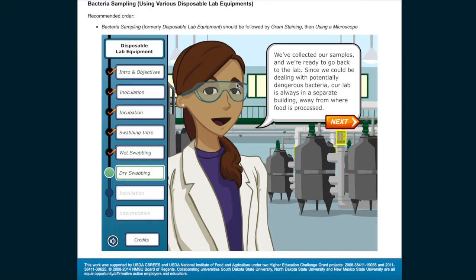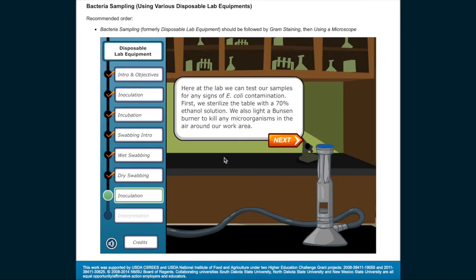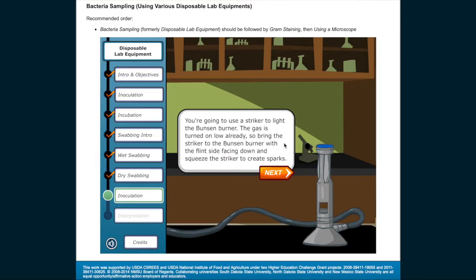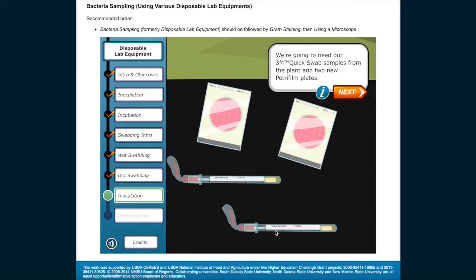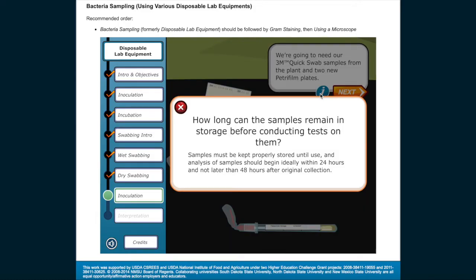Since we could be dealing with potentially dangerous bacteria, our lab is always in a separate building away from where food is processed. Here at the lab, we can test our samples for any signs of E. coli contamination. First, we sterilize the table with a 70% ethanol solution and light a Bunsen burner to kill any microorganisms in the air around our work area. Use a striker with the flint side facing down and squeeze to create sparks to light the burner. We're going to need our 3M quick swab samples from the plant and two new Petri film plates. Samples must be kept properly stored until use, and analysis should begin ideally within 24 hours and not later than 48 hours after original collection.